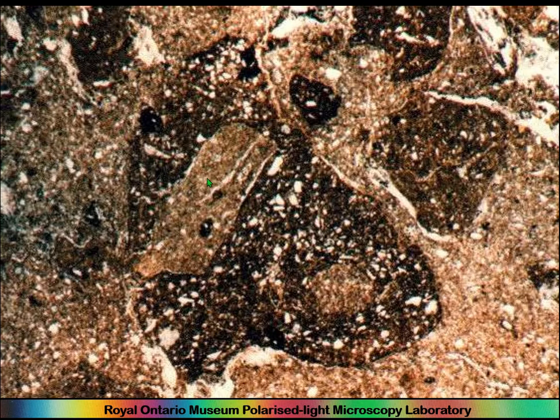And looking at the mineralogy of these at Sangalan Tepe, I assume this is still Sangalan Tepe, there was one in which the petrology of the grog was incompatible with production at the same place that the pottery within the bigger piece of grog was. So this must have been made, or most likely was made, at a different place from this. And the pottery was so different from this that it must have also been made in a different place.